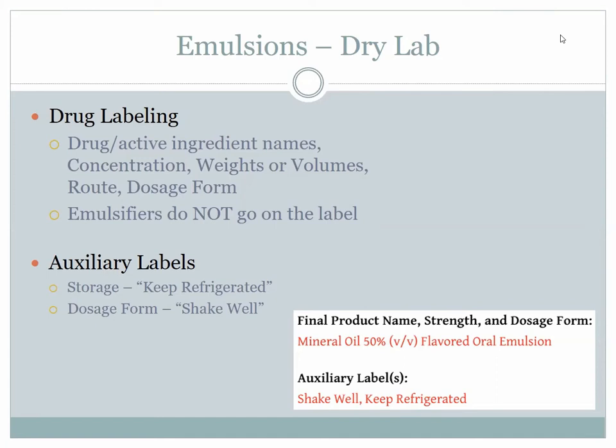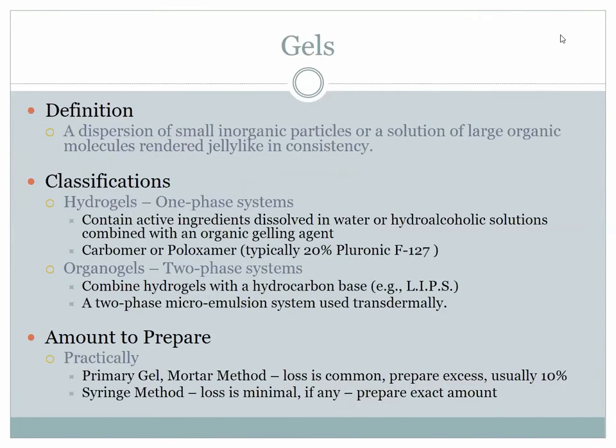Okay, pretty easy. That was essentially an emulsion, a liquid oral emulsion. Now, why didn't we have you guys make one as a part of your wet lab? They're too darn easy. Would you agree? All you have to do, if you don't mess up the first time, is put the internal phases, add your emulsifiers, add the external phase, and shake like crazy. That's really all there is. But it's the calculations to determine the relative amounts of the spans and the tweens that are the most difficult.